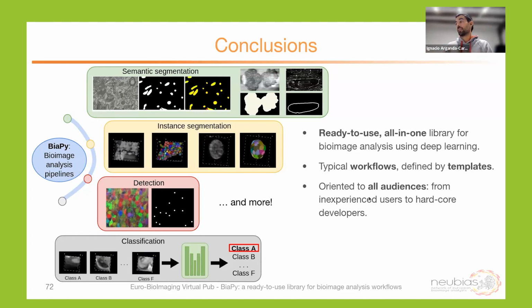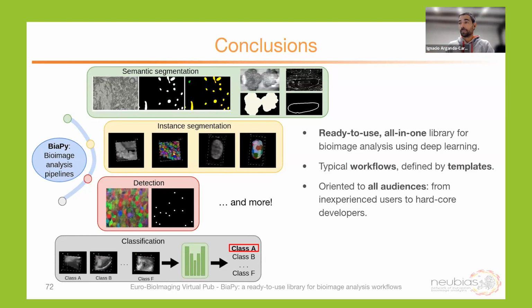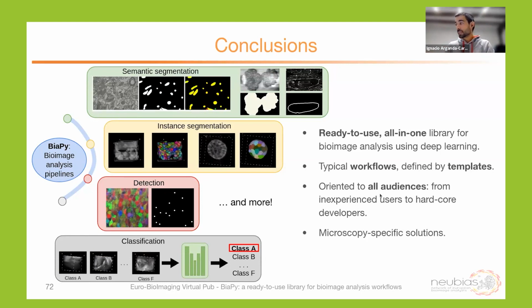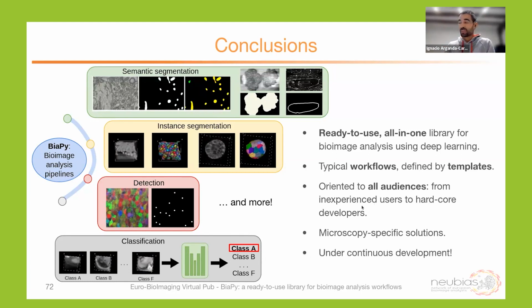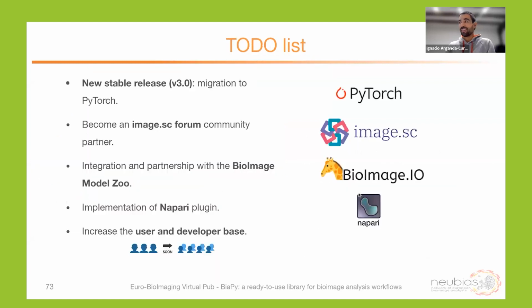And that's why we say that it's oriented to all audiences. Hopefully for many inexperienced users, it could be also attractive. We have microscopy-specific solutions. Again, I showed you that. And I want to remind you that we are under continuous development. So we have a quite interesting to-do list.